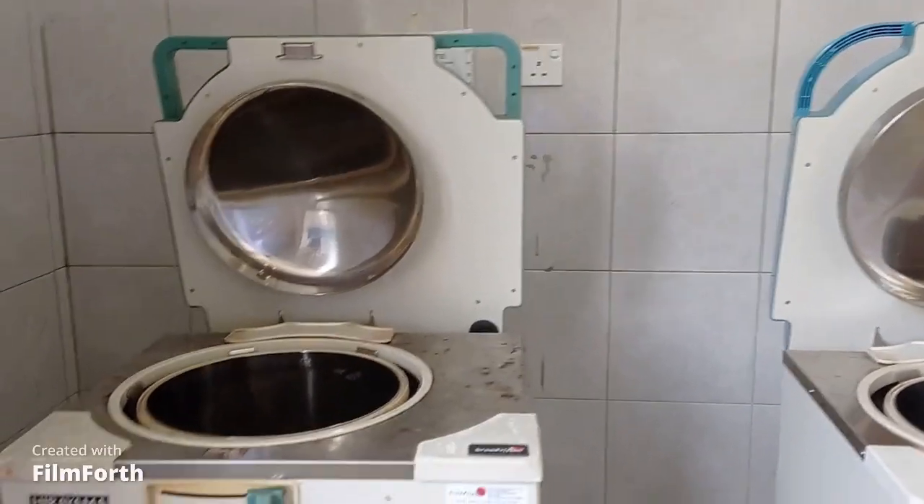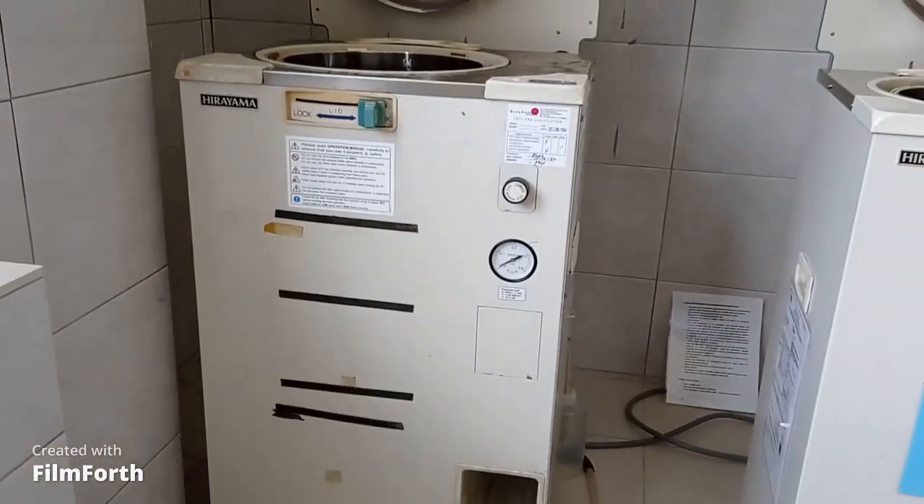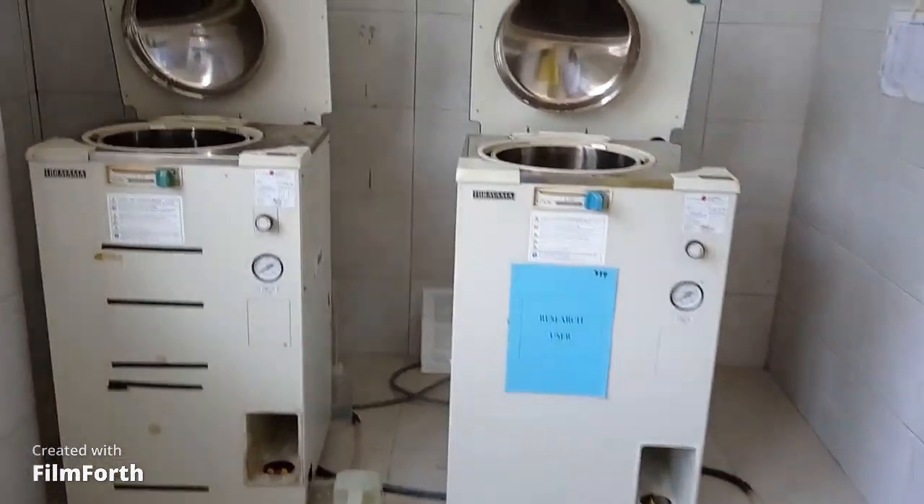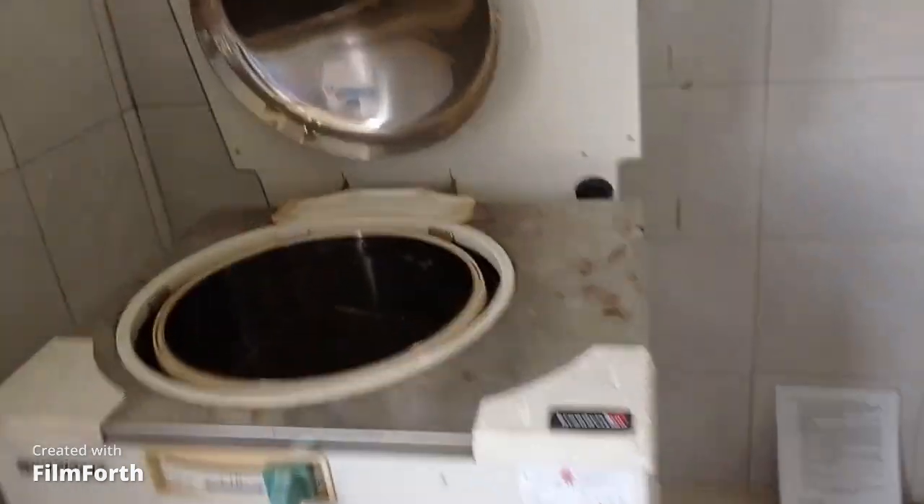Hello everyone, this is Maria and I am back with another video. In this video I will show you how to use an autoclave machine. As you can see, these are two autoclave machines, and in this tutorial I will autoclave the clinical waste.